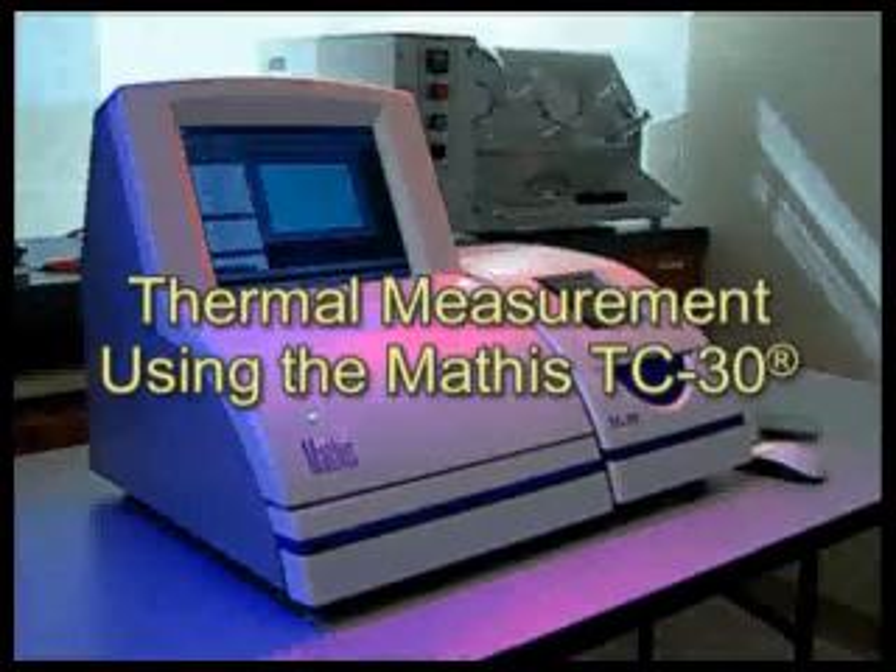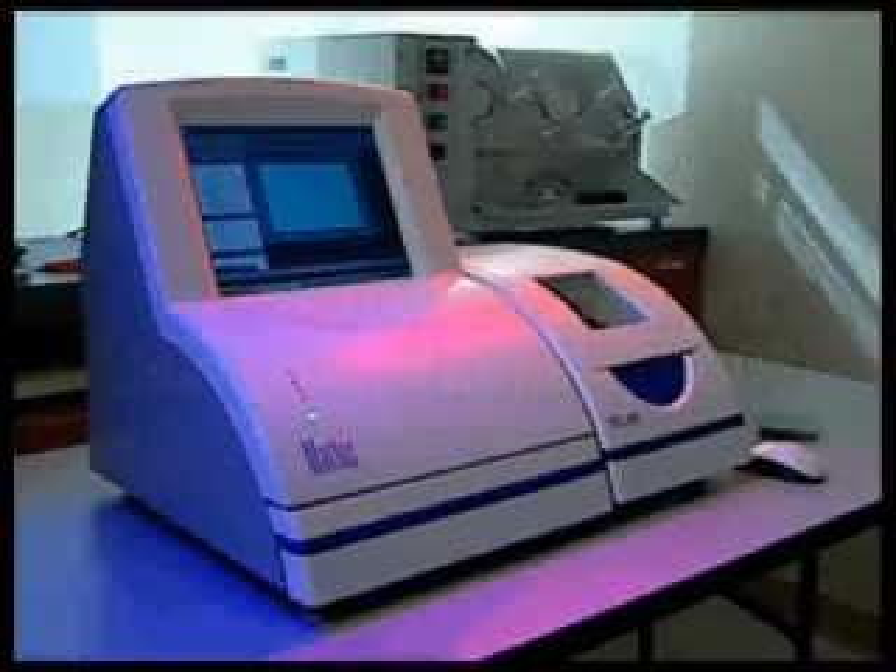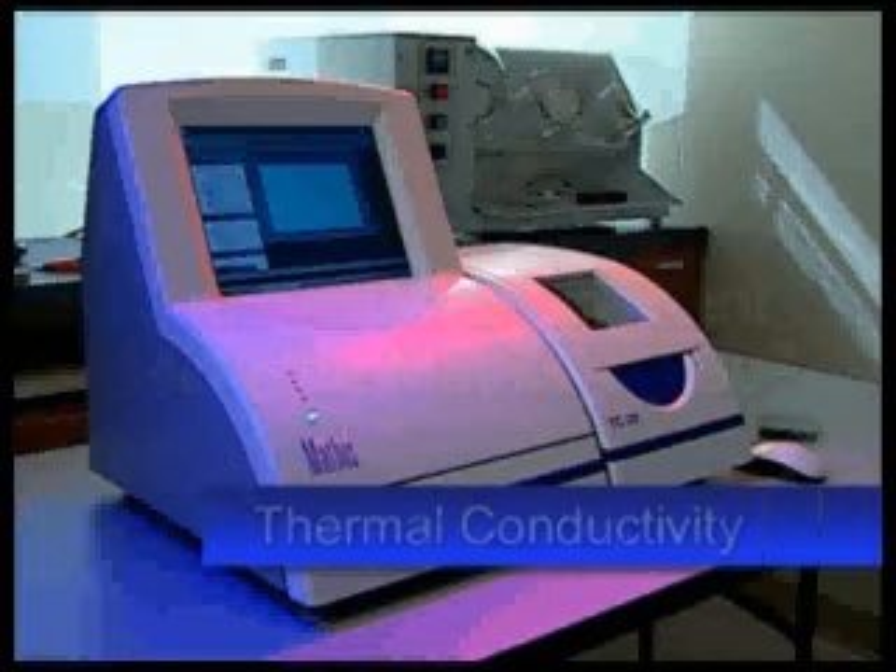The Mathis TC30 has revolutionized thermal measurement by simplifying and accelerating the characterization of materials. It accurately measures thermal conductivity and effusivity directly.